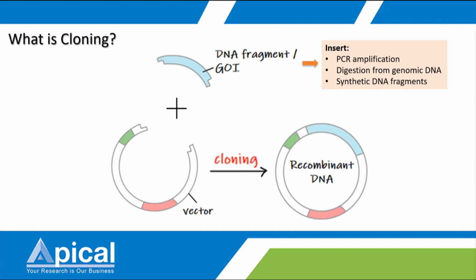Then you will stick, or the correct term, ligate, the insert with a long DNA, which we call a vector. There are two types of vector.